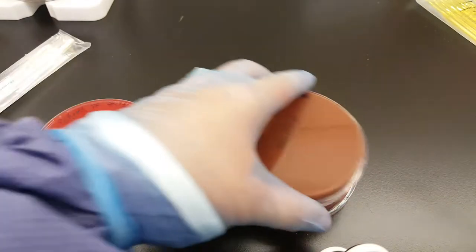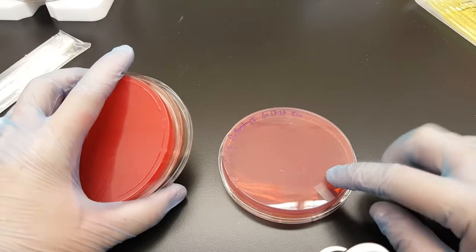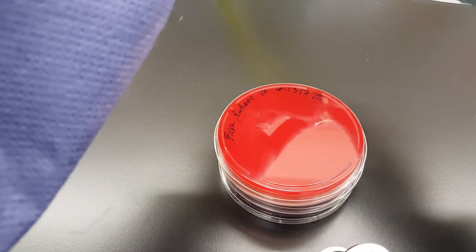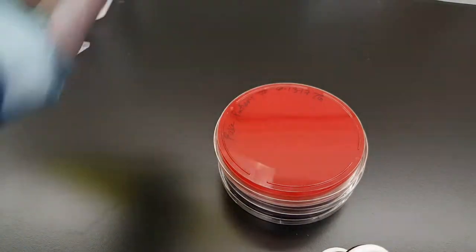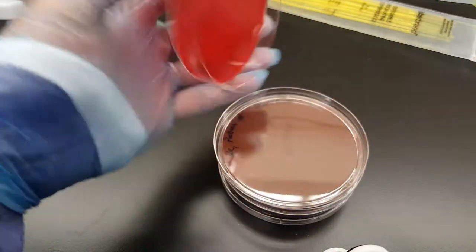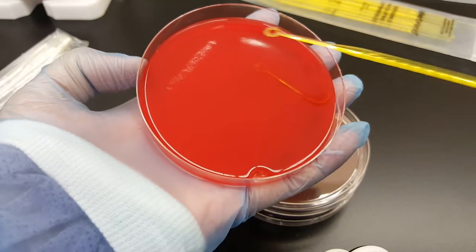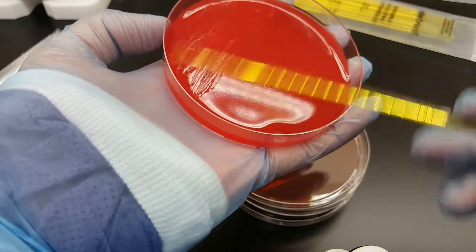The reason we inoculate in that order is so we won't have any transfer of inhibitory contents from the MacConkey onto the plate that should grow everything. Next, we're going to take an inoculating loop. Always shake it out so you're not spreading bacteria all over the place. Then we're going to streak it out, making where we put our swab the first quadrant, and we're going to do it in a four-quadrant series to spread out what we just put on the plate.